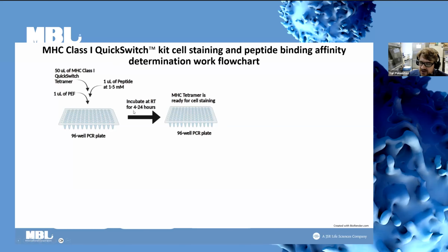However, I would recommend, just so you don't overwhelm yourself in a 1-day experiment, before you leave the lab, just set up an exchange. I mean, just add the 2 solutions and just come back the next morning, just let the exchange go overnight. Basically, it's going to be easier on you. It's going to be better for the peptide. It's going to be better for the MHC molecules, and just easier all around.